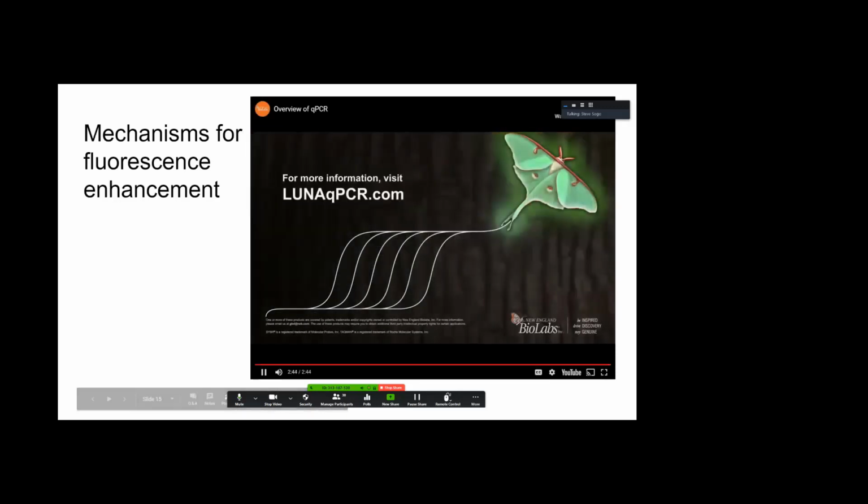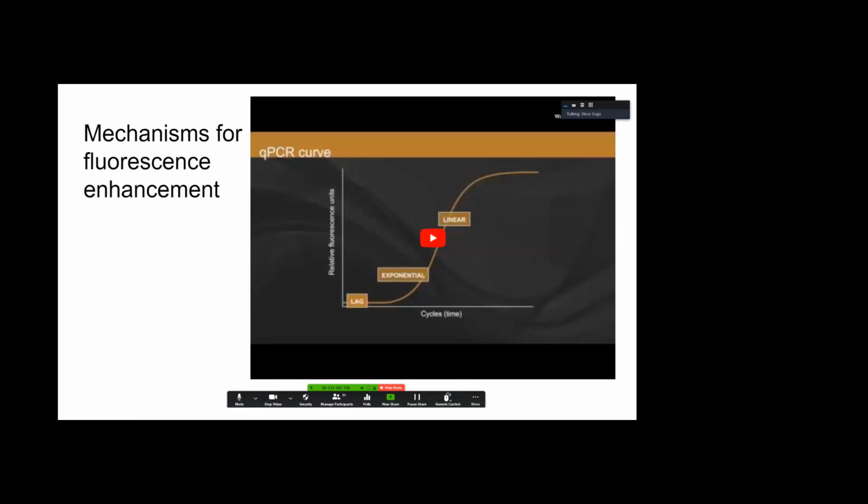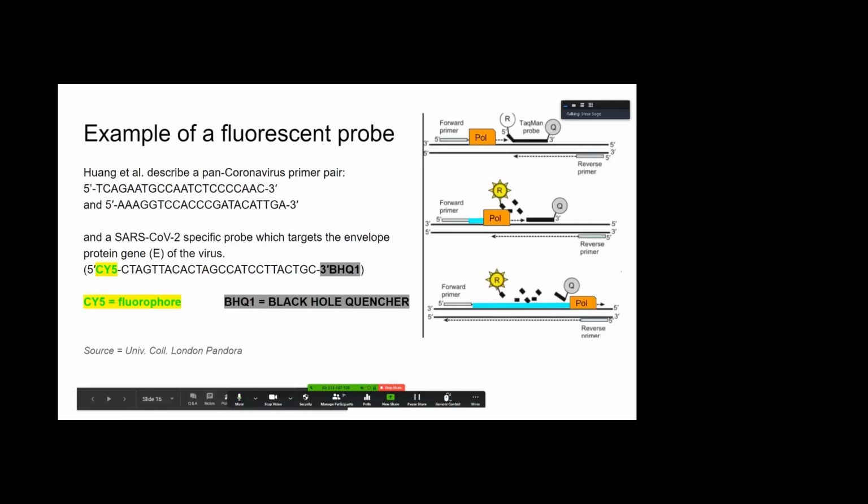All right, so that's the explanation of where this curve comes from. And my next slide is an attempt to explain that again. I think after this is question time. So for this to work, you need a primer. The primer has to recognize viral RNA or DNA. I'm going to use those words interchangeably. It starts as RNA, turns into DNA very, very early in this process.